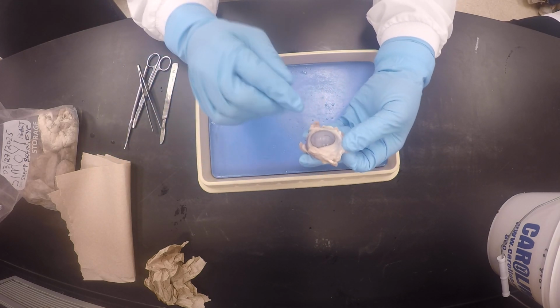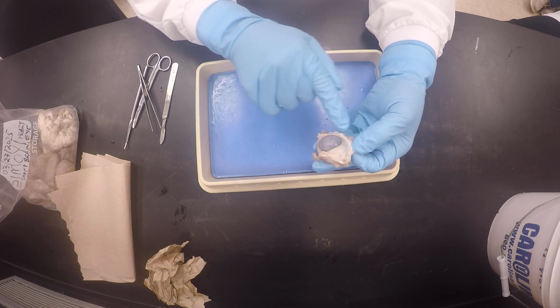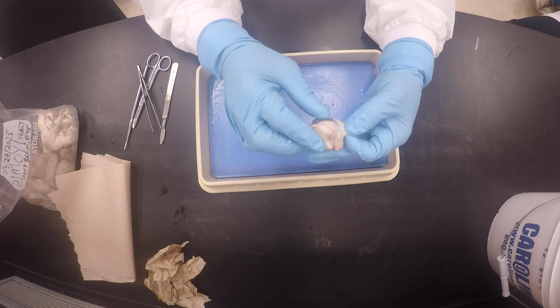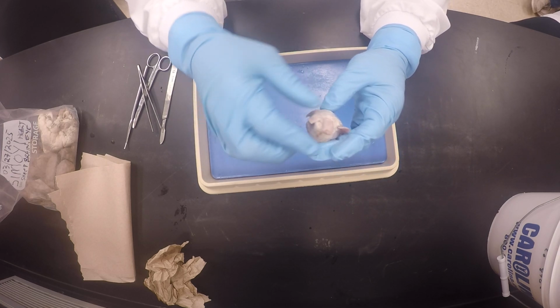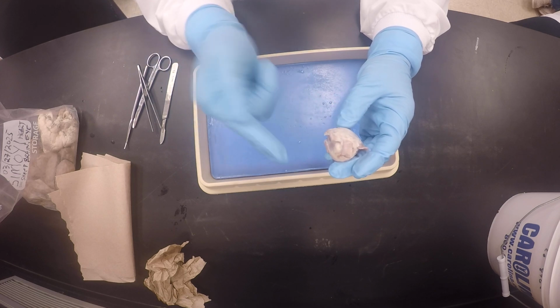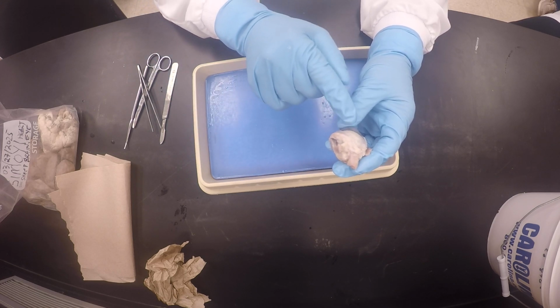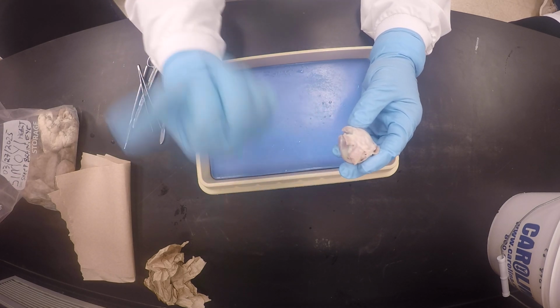And then so now this is the lateral rectus, and we said, because this inferior oblique is pointing towards this, this is the inferior rectus, and then we want to confirm that indeed this is the superior side, correct? Ooh, looky here. We've got one at the compass point and one at an angle. That means definitely this is the superior side. This long side is the superior side. So you get the superior rectus and the superior oblique.